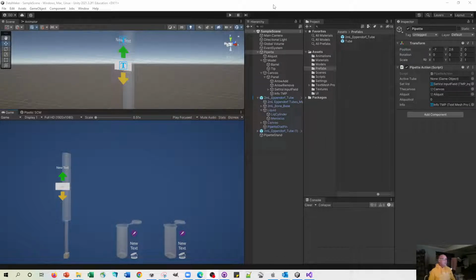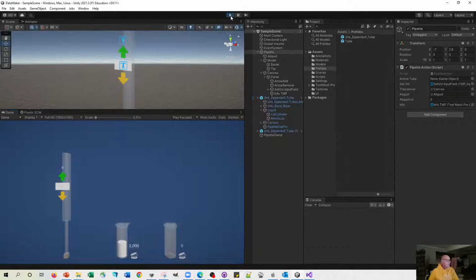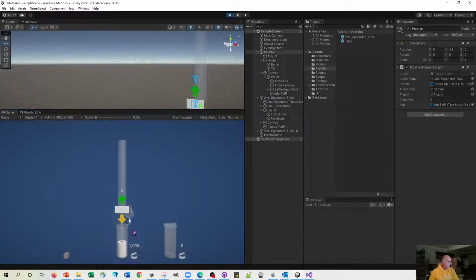So as explained in the summary video, the key major feature now is that this pipette can act in the way of sucking up, but more than one aliquot at a time. So you can start to build a reservoir within the tip, and you can dispense that reservoir in all sorts of different shaped aliquots. So you can actually make it so that it behaves like an Eppendorf Multipette.